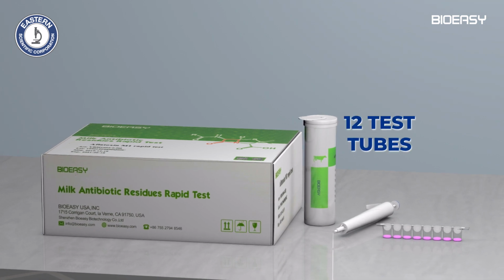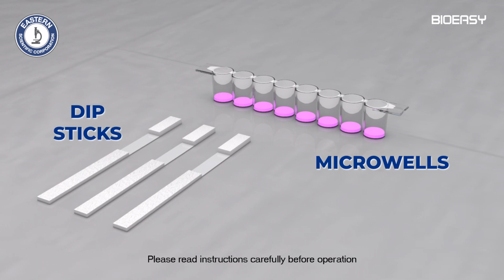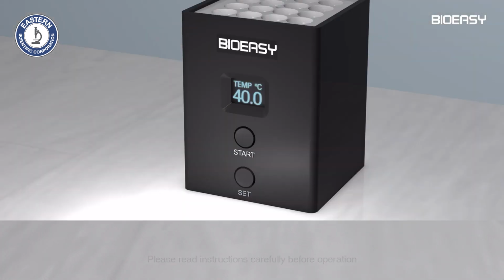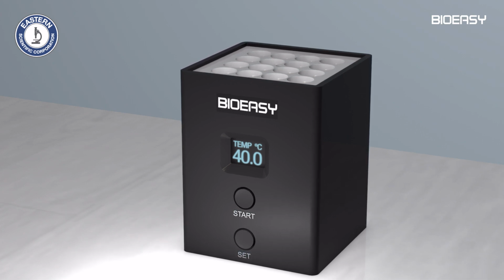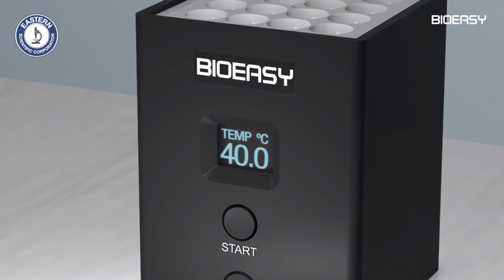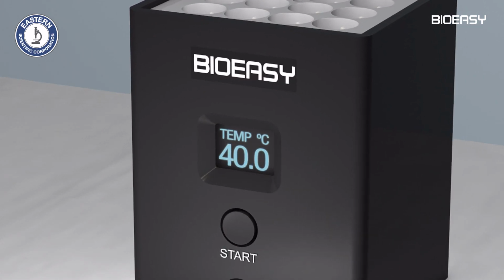It contains 12 test tubes, each with one strip of 8 red reagent microwells and 8 dipsticks. 1 pipette and 100 pipette tips. To conduct the test you need one incubator capable of maintaining a temperature at 40 degrees Celsius. Connect the incubator and wait until the temperature has stabilized at 40 degrees Celsius.